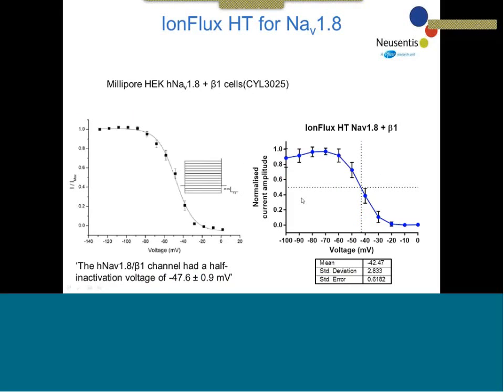Same sort of experiment this time, steady state inactivation. Again, our V half value is in good agreement with the value from the Eurofins brochure. Slope is similar as well, so I'm pretty happy with that.